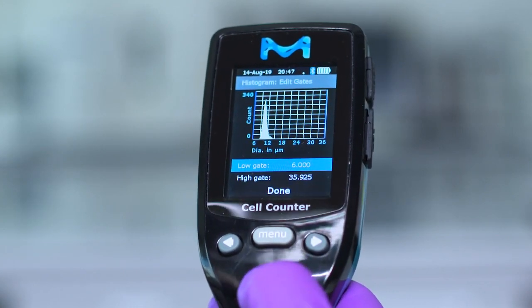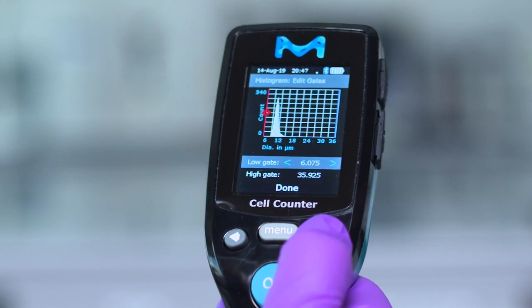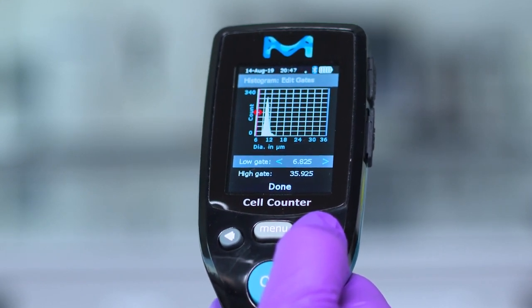Press OK to highlight the low gate and increase or decrease the gate with left and right arrows on the SEPTOR device and press OK.